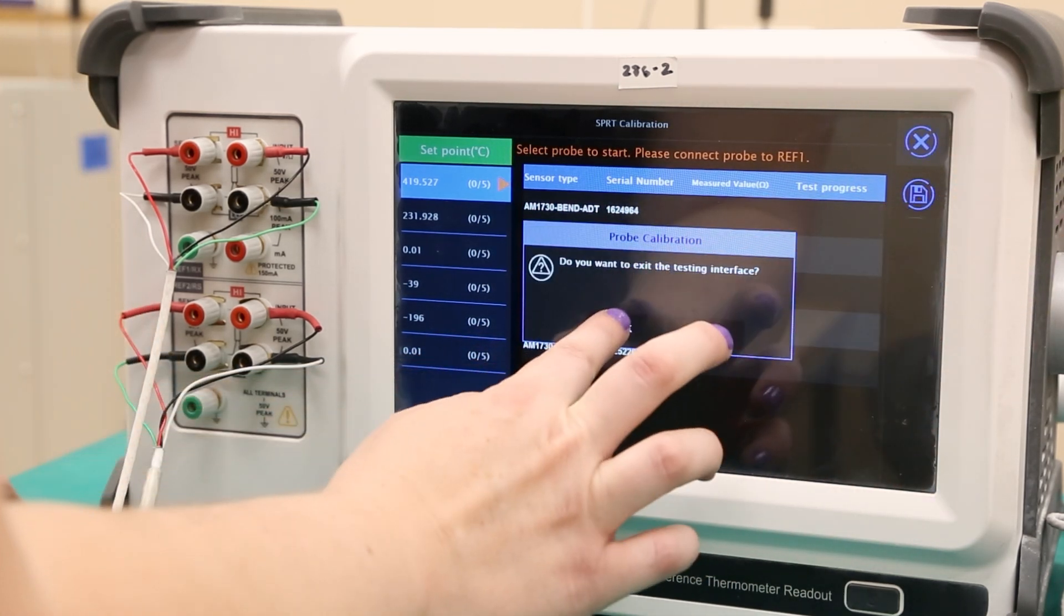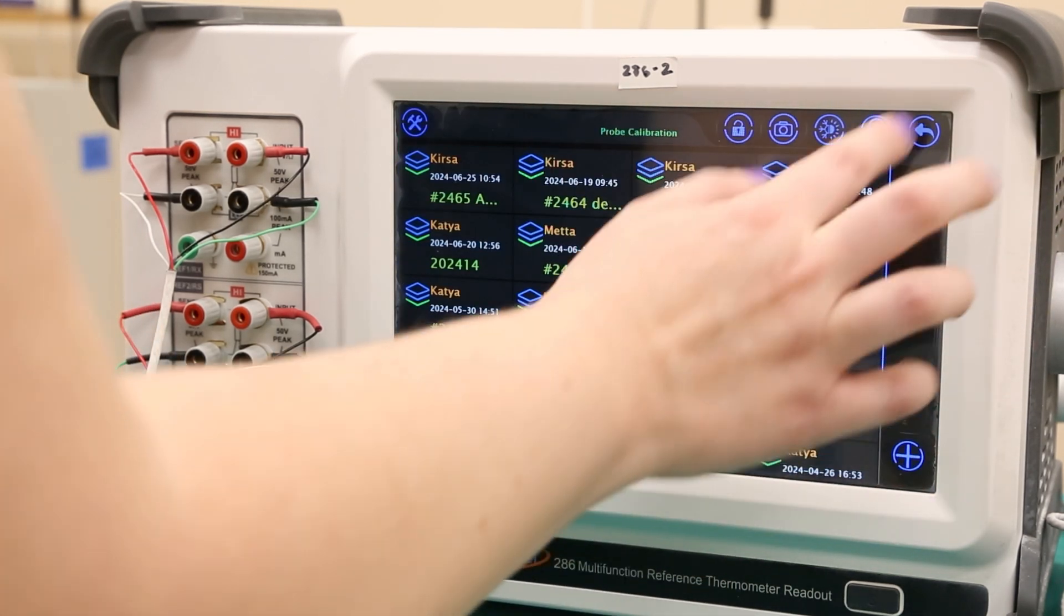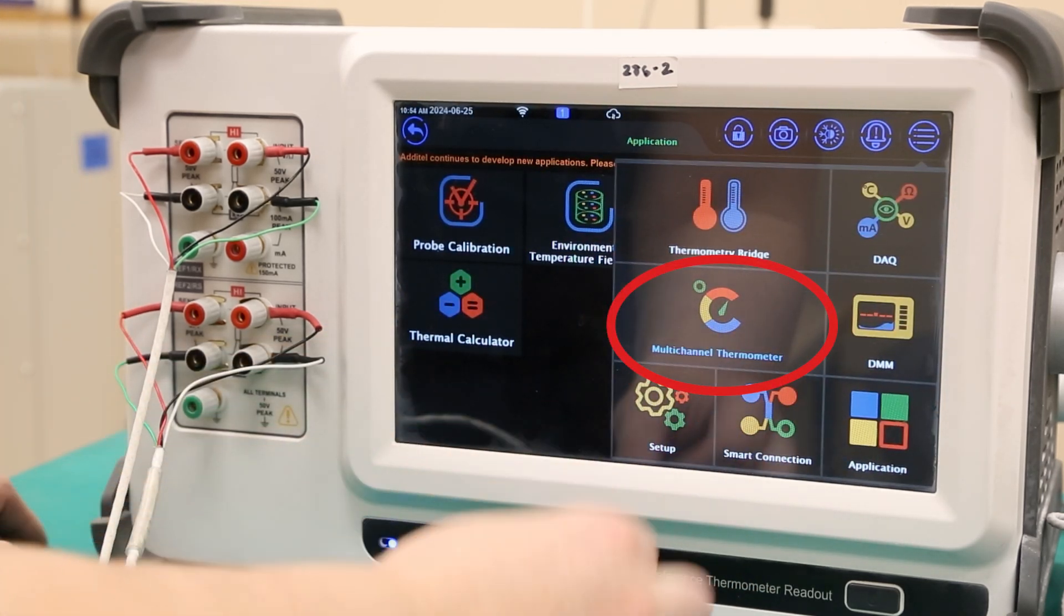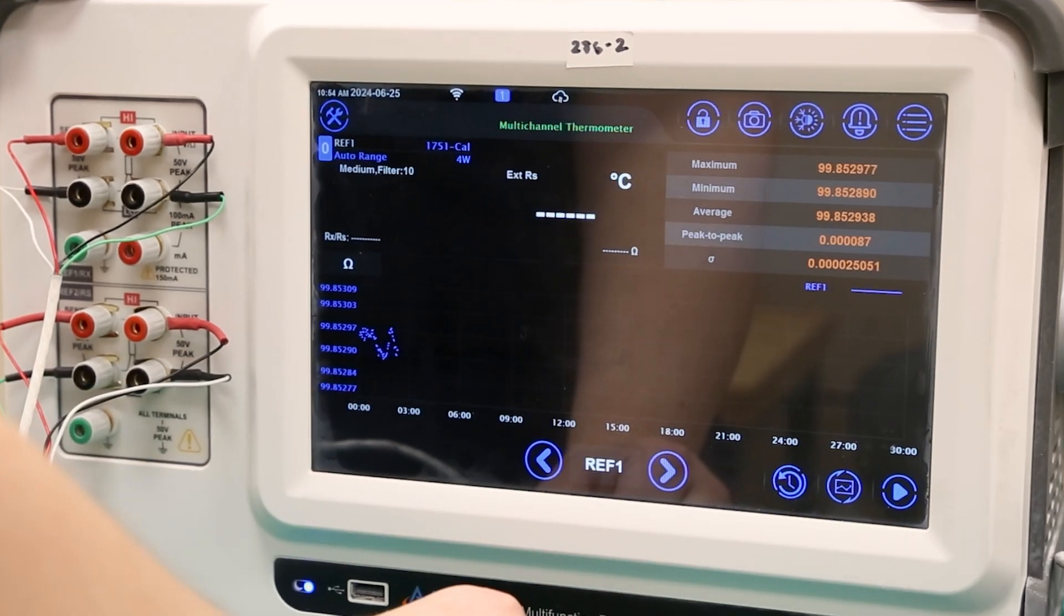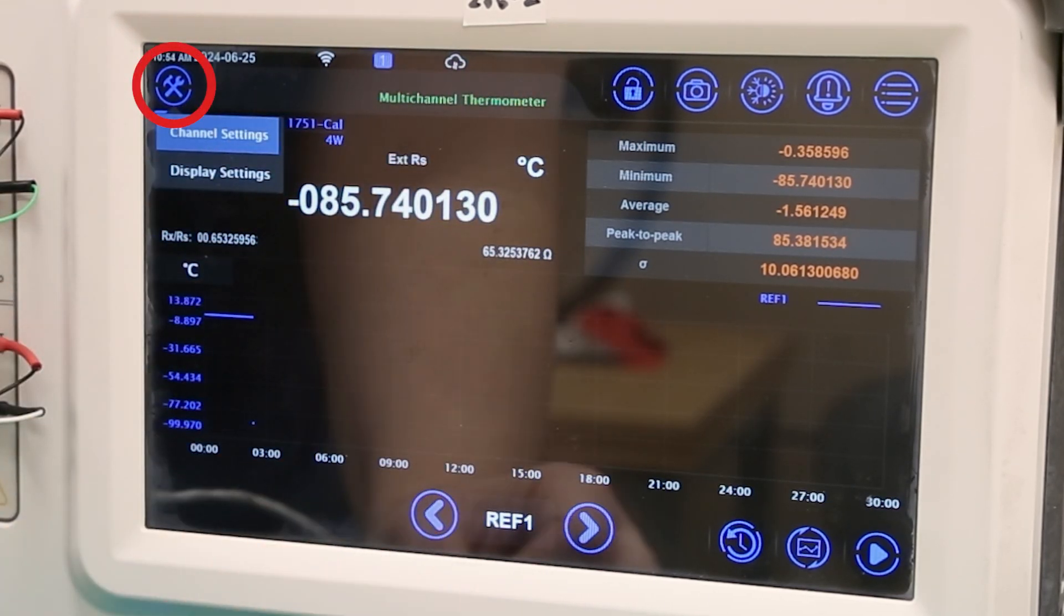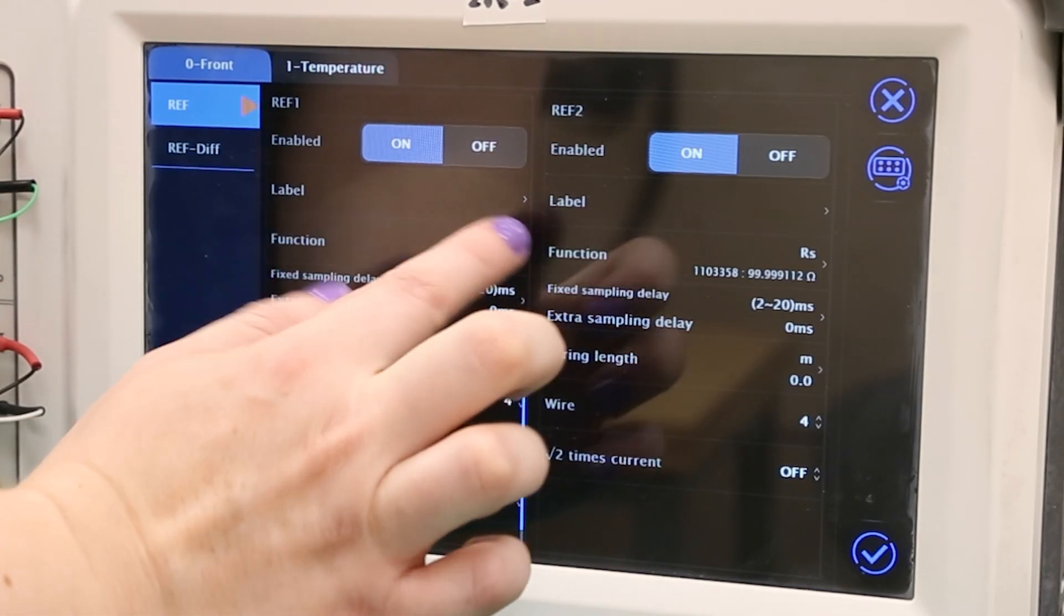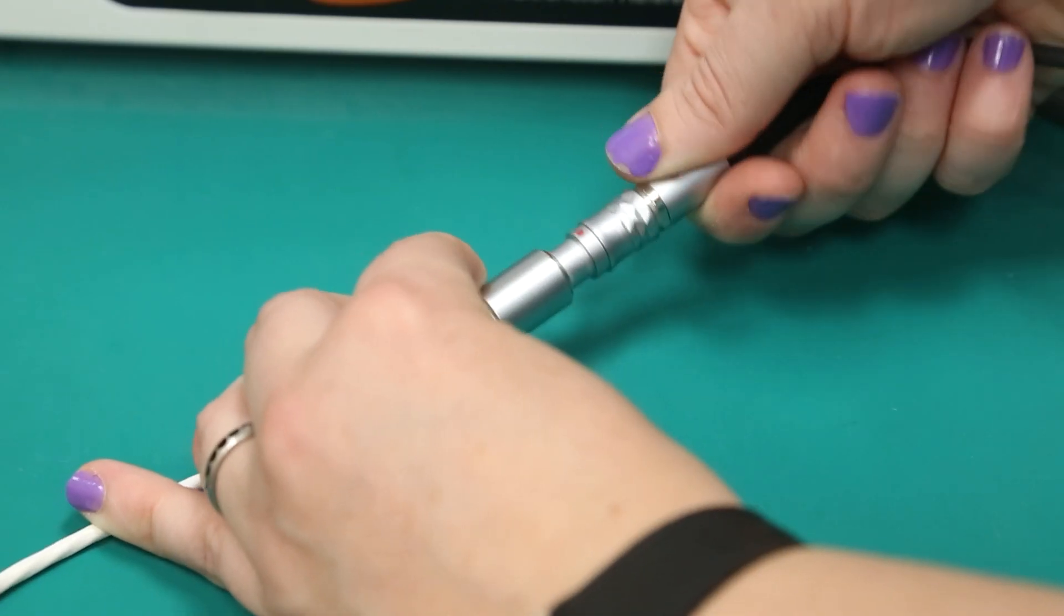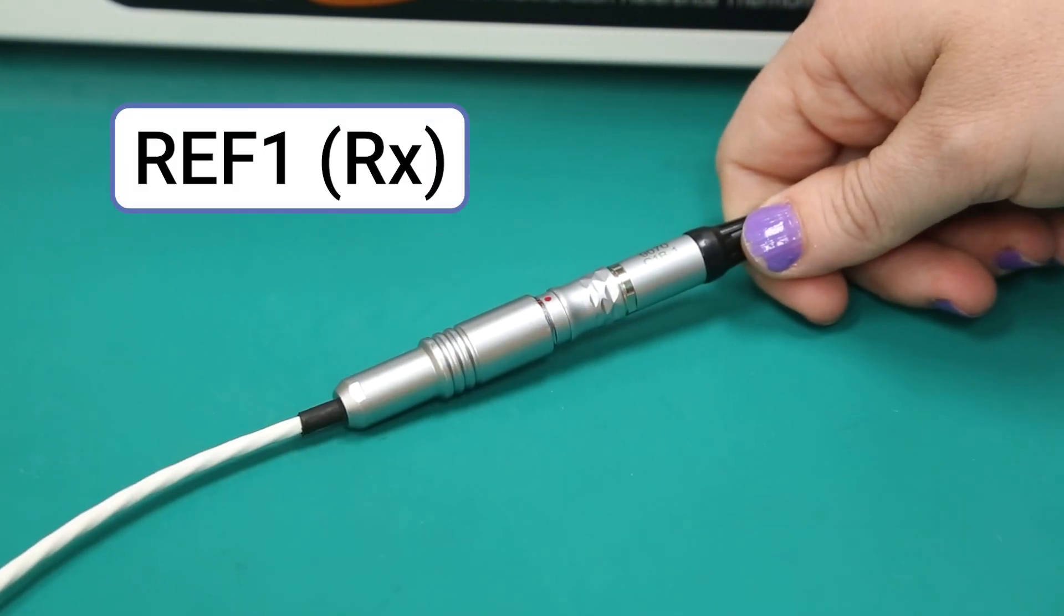From here, we are ready to start, but first want to check that the zinc fixed point cell has reached the freezing point. For this, we will select the multi-channel thermometer from the application menu. To change the channel settings, select the tools icon from the top left corner. Here you can select the correct reference thermometer to check the calibration point.